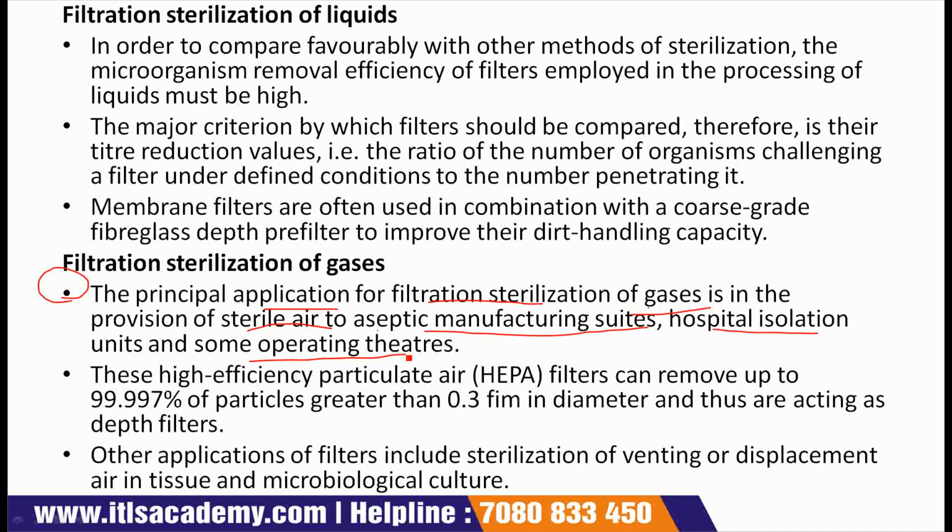Filters employed generally consist of pleated sheet of glass microfibers.